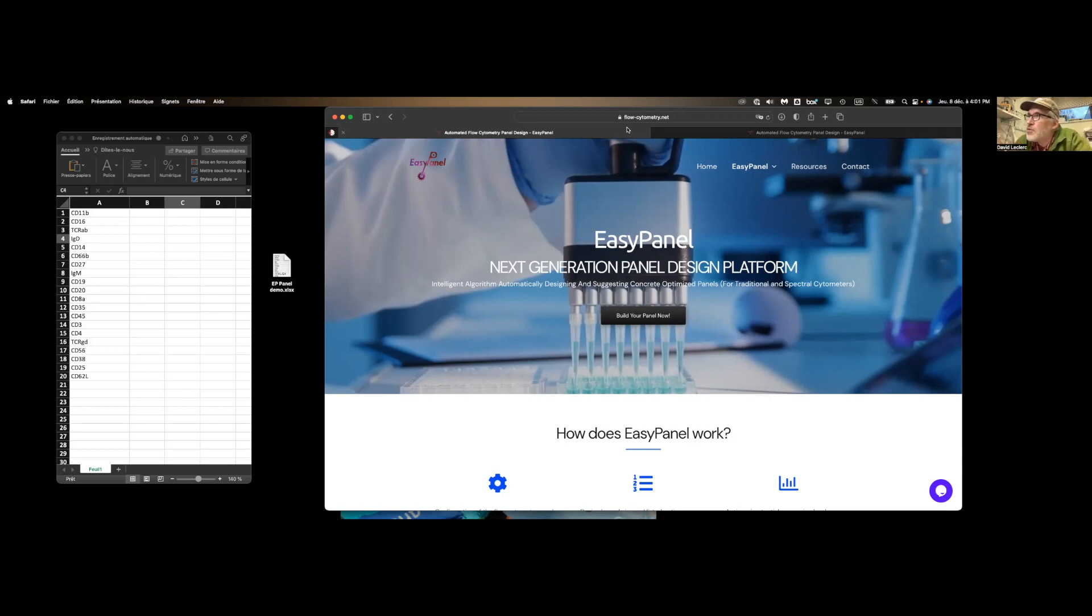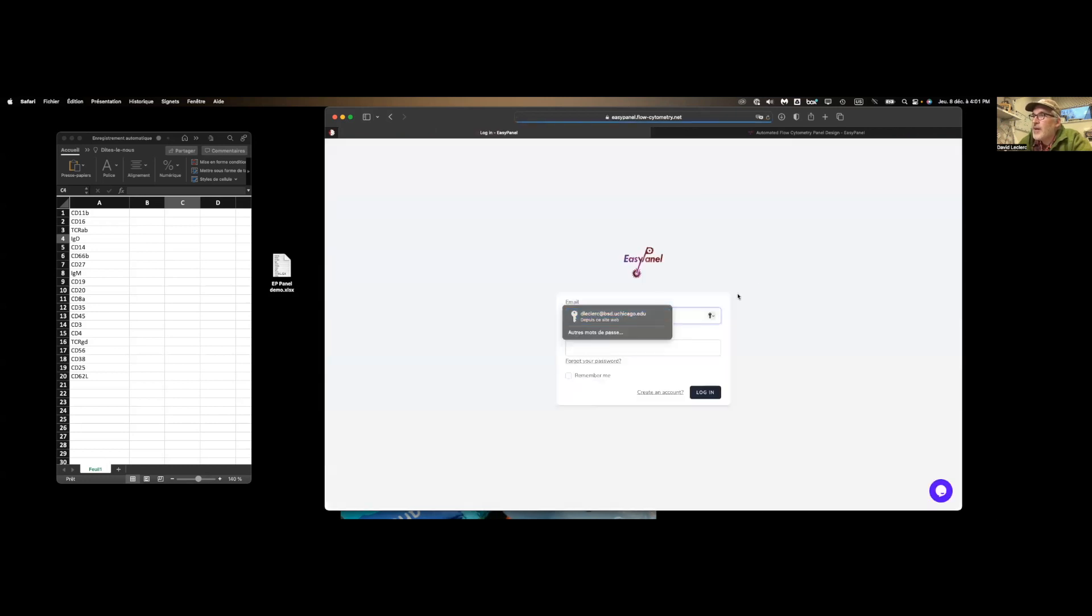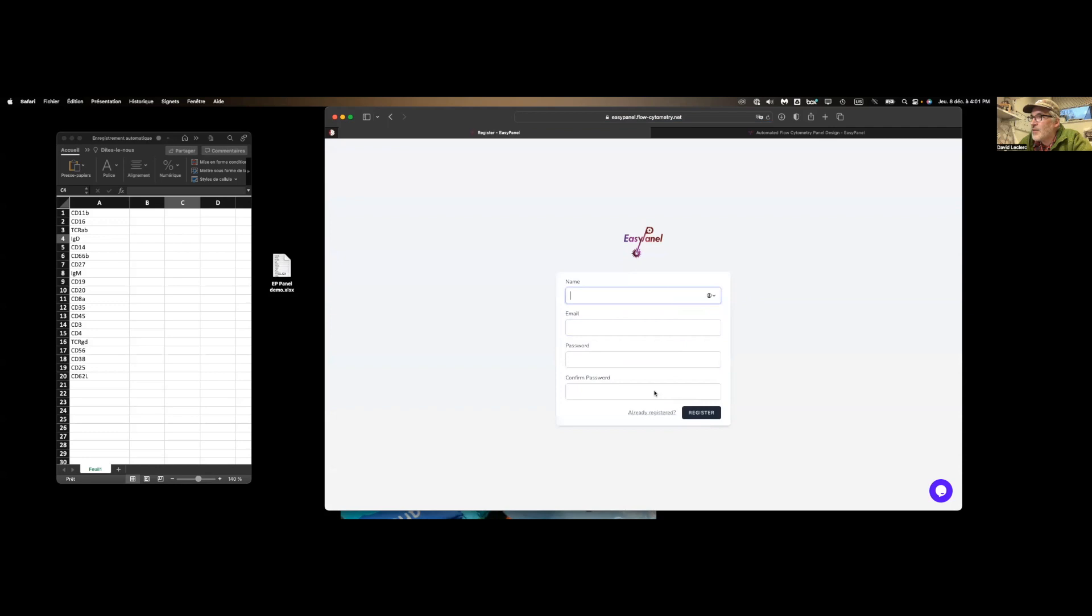So if you go to flow-cytometry.net, you'll get to this page over here. Let's go to build your panel now. And from here, we are asked to log in. If you don't have your account, select create an account here.